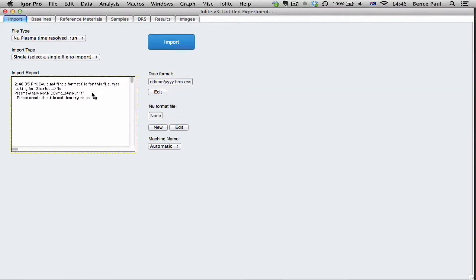So how do we create a new format file? Well to start off with you need to know the column names, the channel names for your .run file before you start.